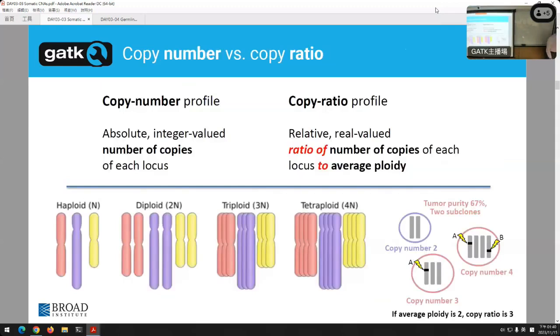All right. So we're going to talk about there's copy number and copy ratio. Copy number is an absolute thing. Usually you say there's an extra chromosome. So instead of copy number 2, it's copy number 3. That assumes integer-based things. Remember that picture I showed you before? Things aren't necessarily integers. And so we can't always assume that even though one part is copied in this copy, maybe only half of that was copied in another. So there's actually fractional copies we can have.